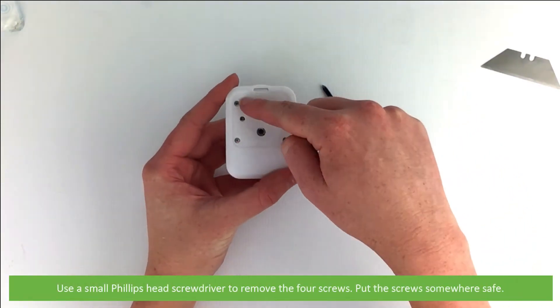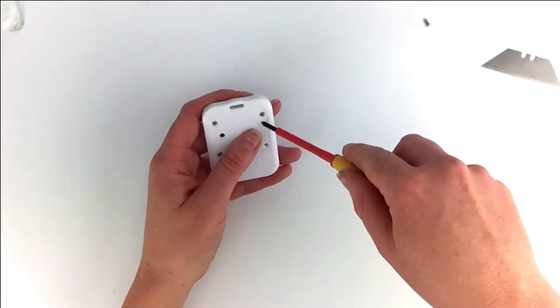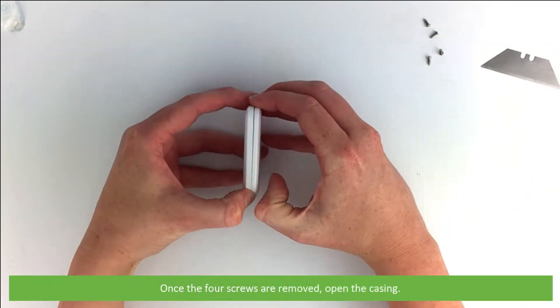Use the small phillips head screwdriver to remove the four screws. Put the screws aside somewhere safe. Once the four screws are removed, open the casing.